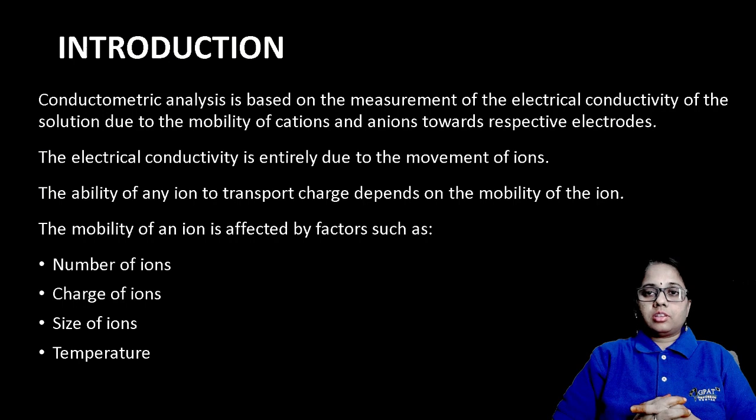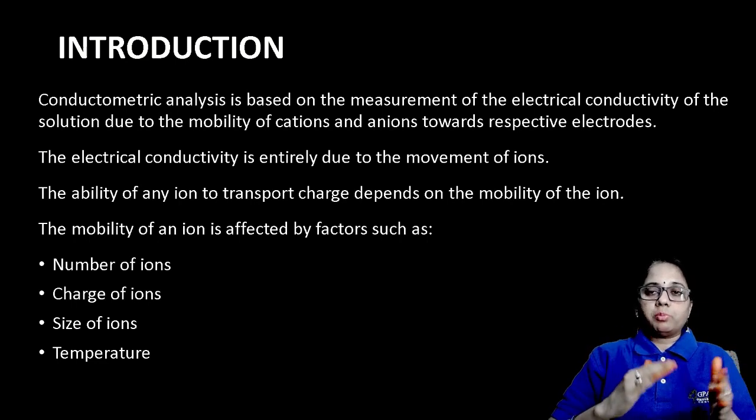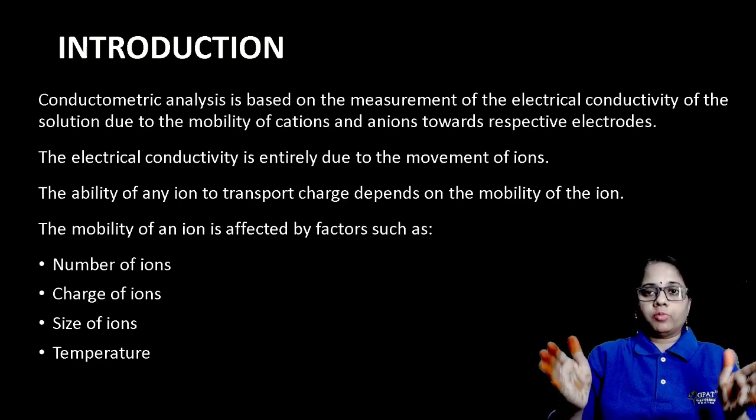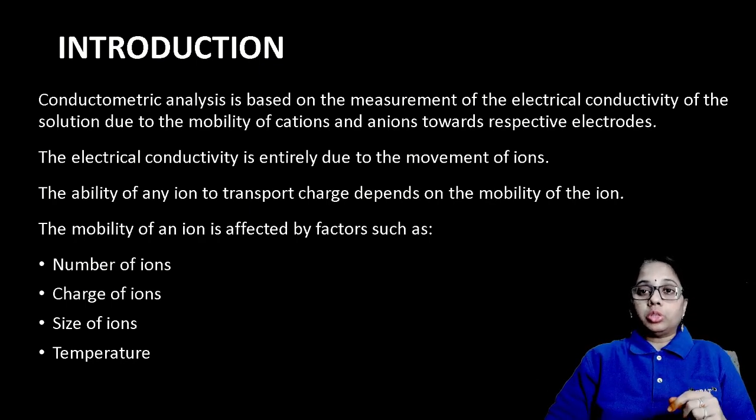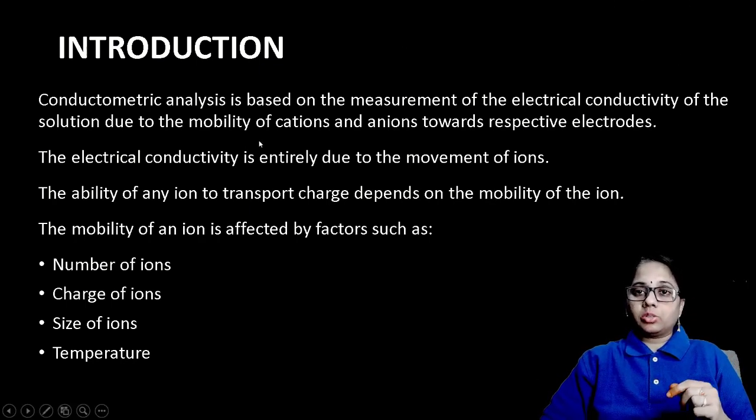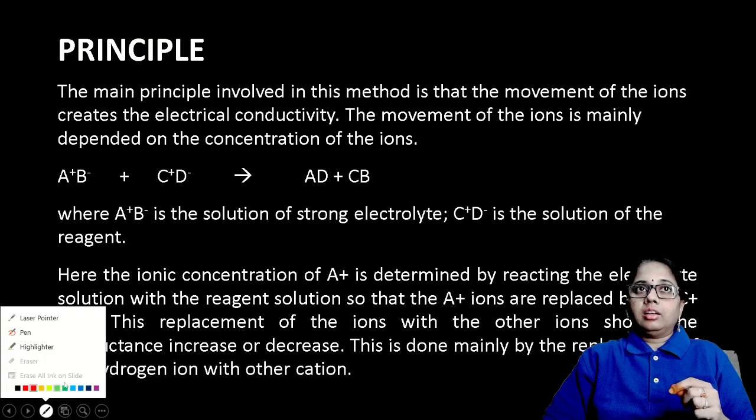Let us first have a glimpse at the introduction of what conductometry is. Conductometry analysis is based on the measurement of electrical conductivity of the solution. This electrical conductivity happens due to the mobility of the ions.